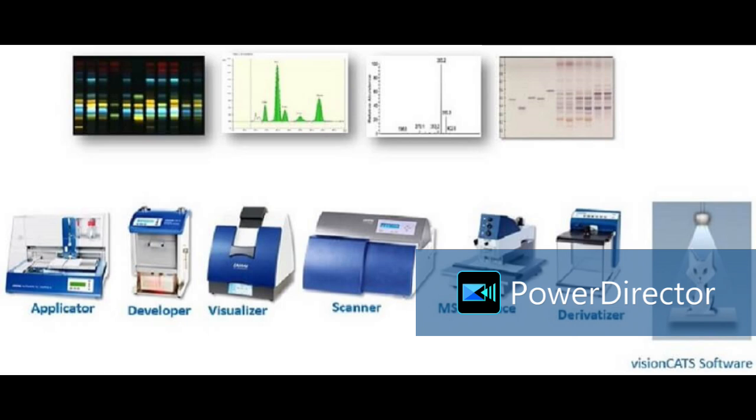We can give the command, but between each new sample and standard we have to rinse the syringe manually and fill the syringe manually with that particular sample. That part is only manual, otherwise it is automatic like this one. And this is completely automatic. Here your samples you can keep in vials, and in a programmed way it will apply the samples on the plate in band-wise form.